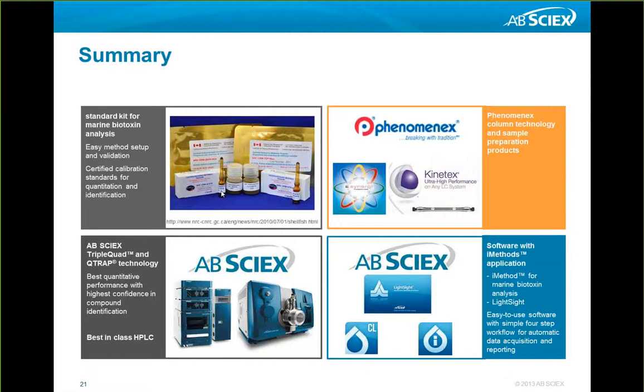These standards are not easy to make because the compounds are quite complex, so we can't synthesize them. We are utilizing fresh mussels, for example, or phytoplankton to produce those chemicals.